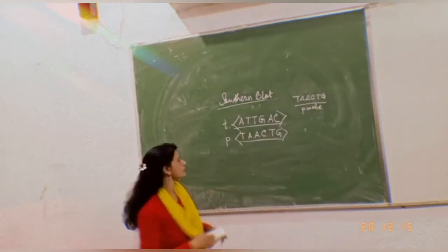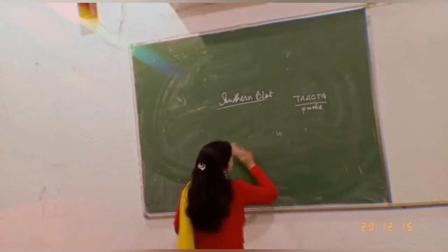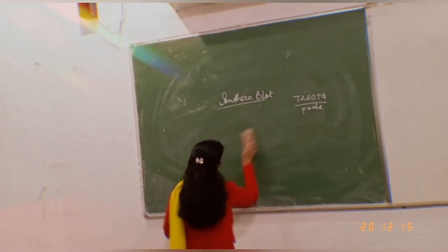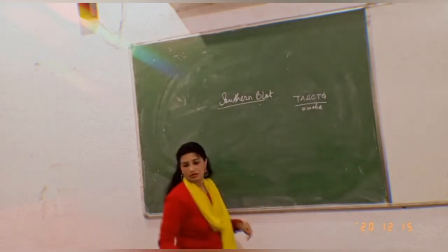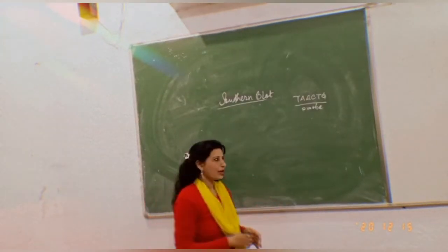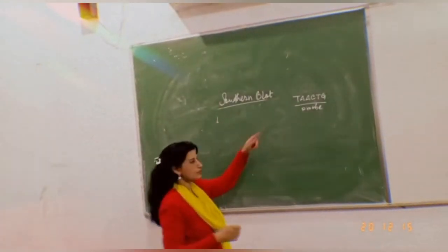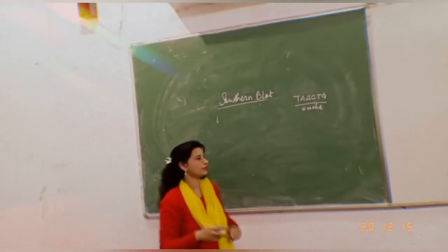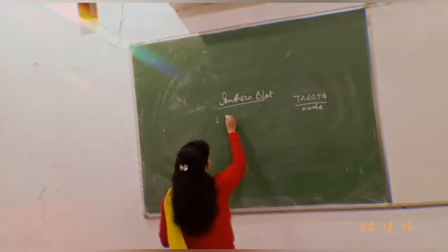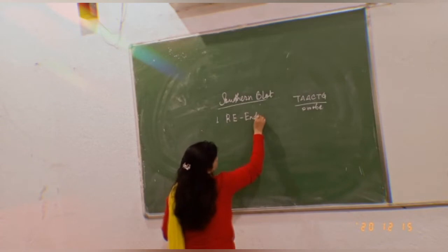So what I have got is my sample, which is a mixture: the meat contents are there, a lot of DNA, and some other contents are also there. Now the DNA helical structure is very long. Let me write down the first step. The first step is breaking the fragments into smaller pieces. So how do I do it? For breaking, I need a restriction enzyme, and that restriction enzyme is an endonuclease.